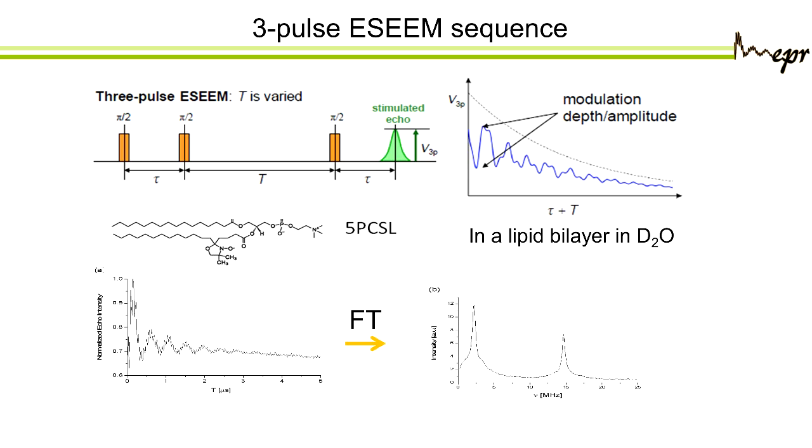Now, if you look well at the deuterium line, what do you see? You see a sharp line on some hump. This hump comes from strongly coupled deuteron, and these are these that give this hydrogen bond. So it's the same thing we've seen before in a different form. Right? So these are the hydrogen bonded water molecule on the nitroxide.